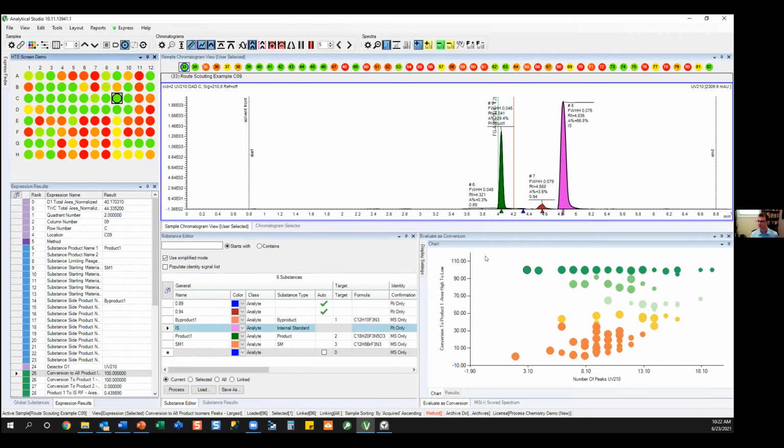So we would choose something on this left-hand side of the graph. Now, on the y-axis, we are plotting conversion percentage. And so clearly a higher conversion is better. So then we would be focusing in on something toward the top of this graph. So immediately you can see that we are narrowing in on the top left corner of this plot.